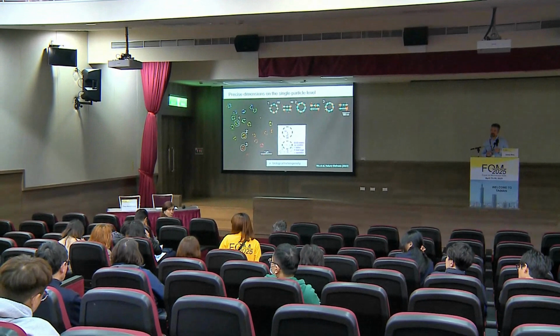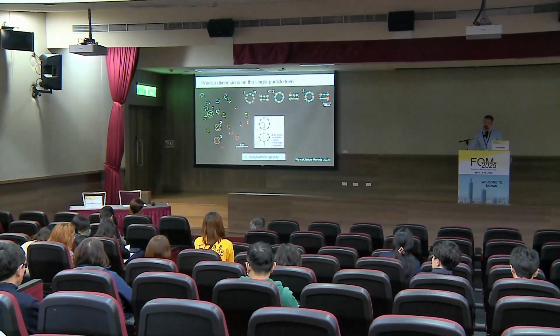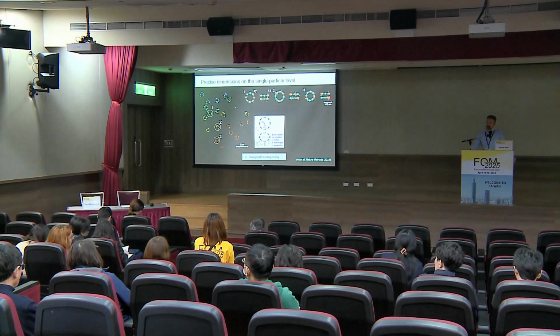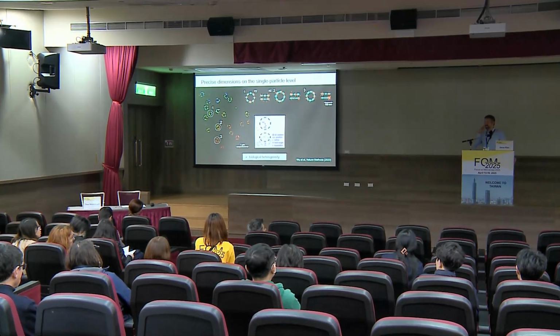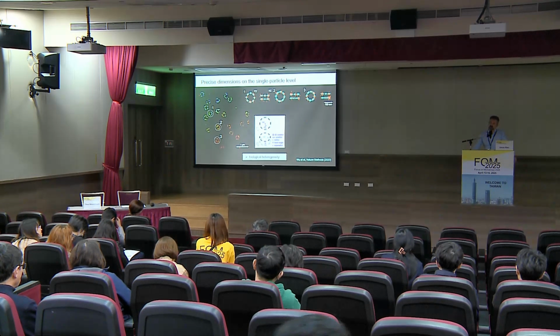You mentioned ratiometric imaging. Could we also use ratiometric imaging with the same dye to detect spectral shifts? Yes, of course, it would be nice. We tried this once for a long time until we found that the published spectral shifts don't exist, and so we gave it up. But yeah, clearly you can look at it and then look at membrane-binding proteins or other intercalating dyes and see how they shift.